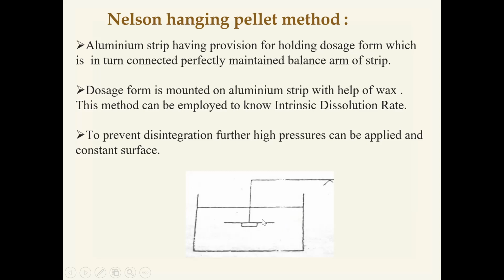Next, this is in turn connected to an arm of a balance, that is maintained perfectly during the dissolution process. This is connected to an arm of a balance.